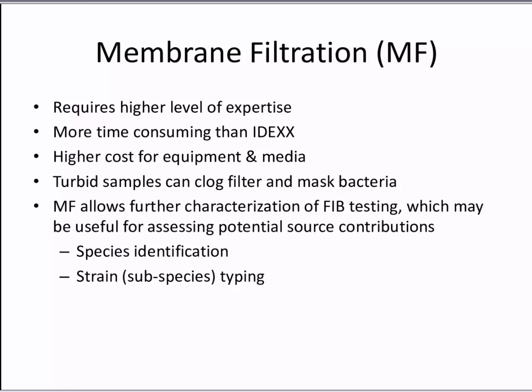But the advantage to using membrane filtration, and this is one reason why public health labs like this method, is because it allows for further characterization of fecal indicator bacteria, which I'll describe later, which could be useful for assessing potential source contributions. So by characterization, I mean species identification and even strain or subspecies typing using DNA typing methods.